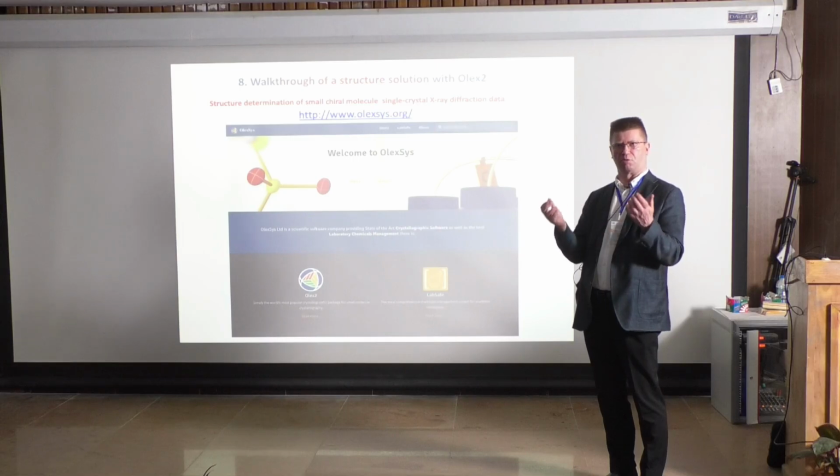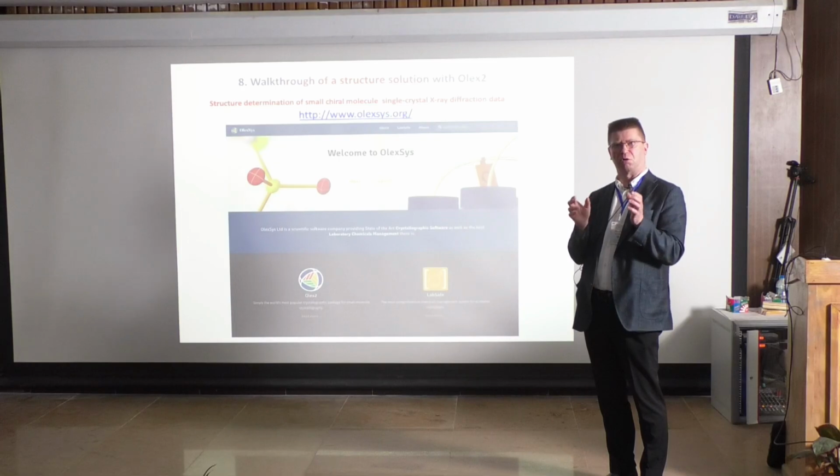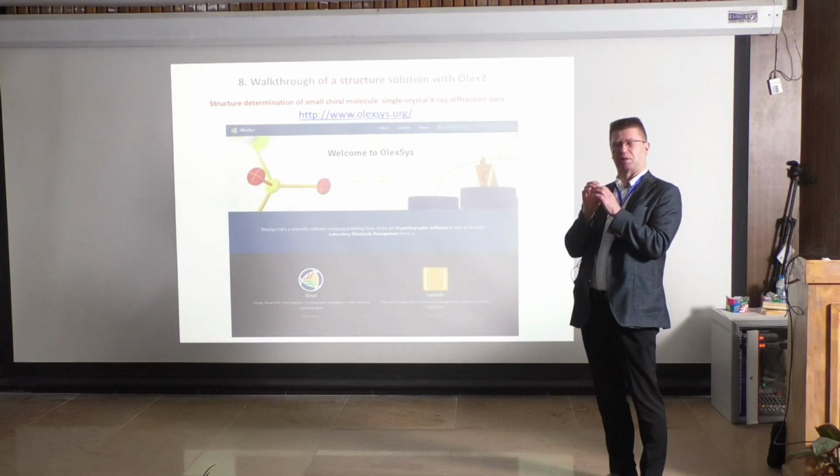There are automatic programs which analyze the data, and they guess. That will be the first guess. Okay, this could be the case. But now even that one appears in the new programs as an electron density, not a map, but appearing like atomic balls. But you don't know, it's just a ball.